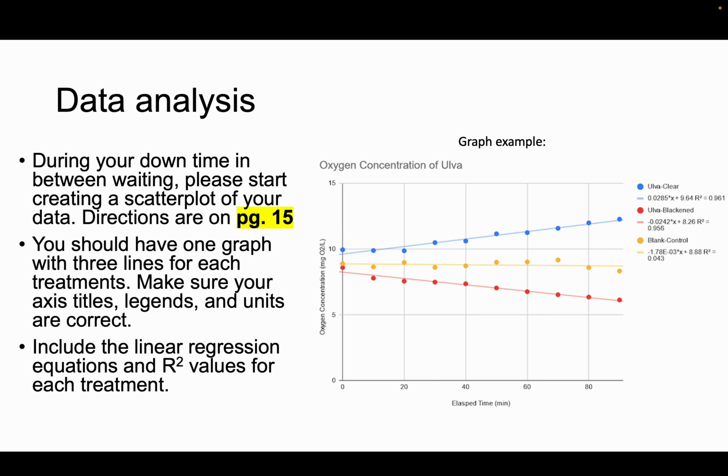Now, this is an Excel sheet that is not realistic because your data will not be as clear as this. Usually, what happens is that your data fluctuates a lot within the first 20 minutes. It's not until after the first 30 minutes where you start to see a trend.